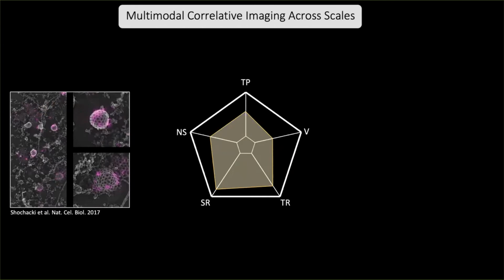However, right after fixation, the cells are unroofed to expose the surface that is adhered to the substrate. And then the nice thing is one has access to these sites on the membrane, so you can stain with antibodies. Antibodies are attached to fluorophores that are more resistant to the conditions of both imaging and sample prep, so you get much higher brightness and photon yield from such preparations.